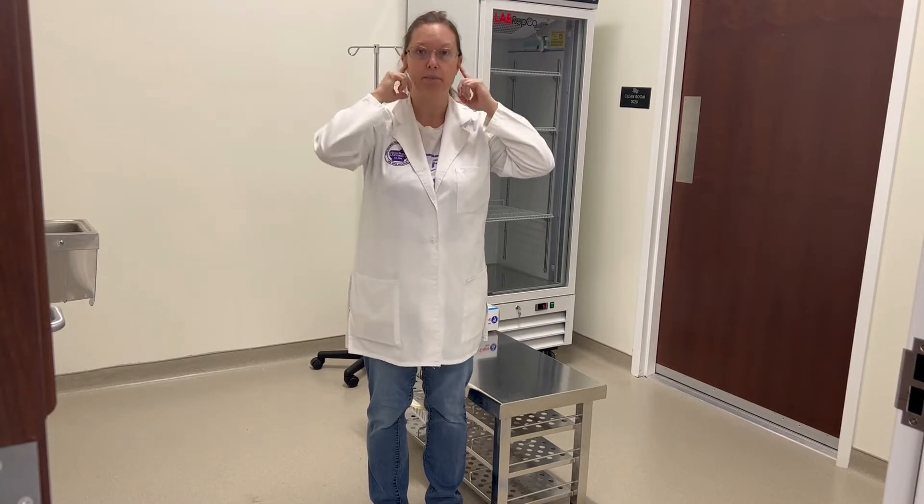Number one, make sure your hair is out of your face — it needs to be pulled back. Gentlemen, if you have a beard or facial hair, you will need to wear a beard cover.